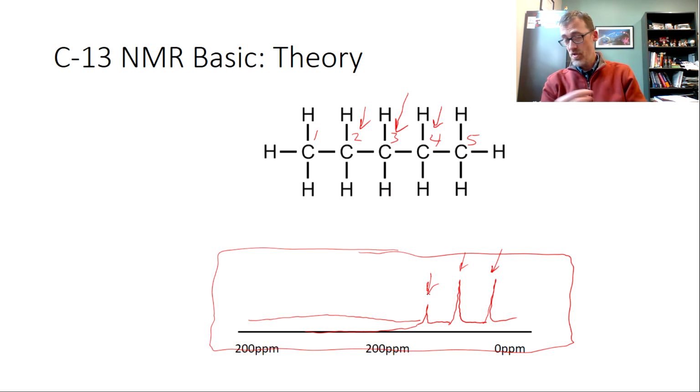it can give us a pretty good idea of what the molecules are. Now, also maybe as a teaser, carbon-13 is only one of many experiments we can run with an NMR. We could also analyze the hydrogens that are present. If there are nitrogens, you can look at those, and chlorines and fluorine, so we can look at other elements as well and get a better picture. But we can do pretty well in your lab today just by looking at the carbons and making sense of it. So anyhow, I hope this is clear and helps you get a good start in lab this week.